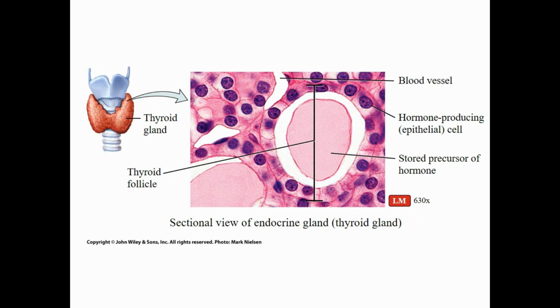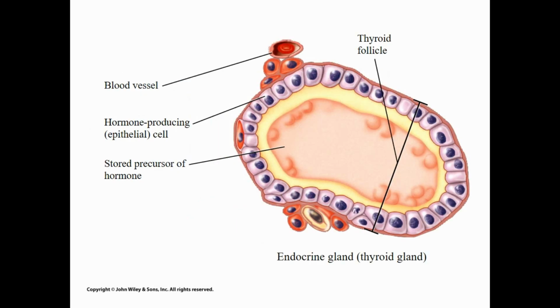Now we'll move on to the gland. We find glandular tissue. We're talking about this row right here. That would be simple cuboidal inside the gland of the thyroid gland. And then here we see it again. If I ask what is the epithelial tissue, that would be simple cuboidal.